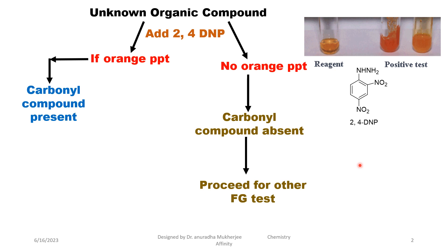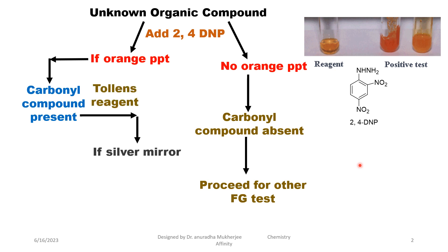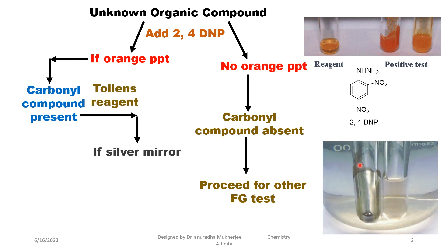So proceed for other functional group tests. Now add Tollens' reagent to the unknown organic compound which contains a carbonyl functional group, because we have to find out whether it is an aldehyde or a ketone.